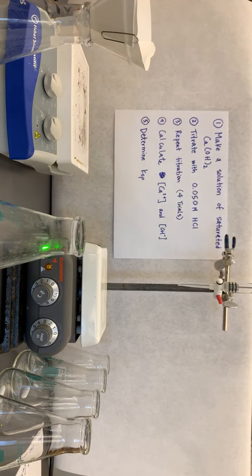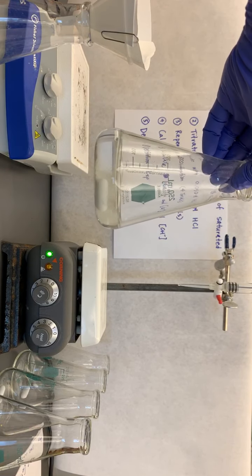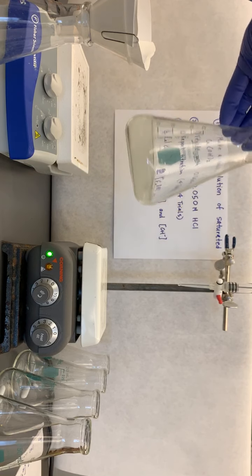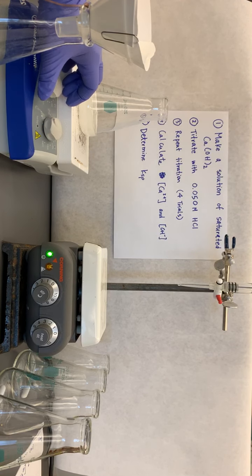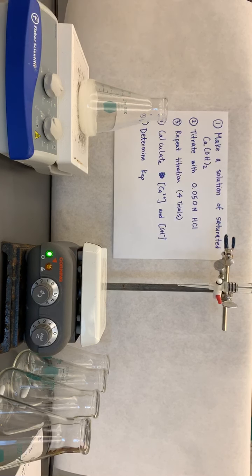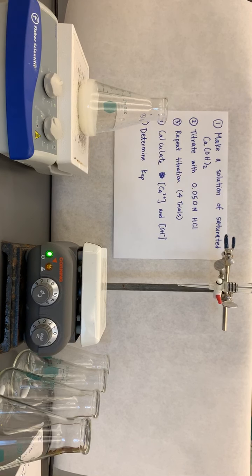Okay, so now I've got my calcium hydroxide in water. You can't really see it because it's a white solid, but you can kind of see the white solid there. I'm going to put it on the stir plate and get that stirring. The idea is as much as will dissolve if I let it stir for a little bit.